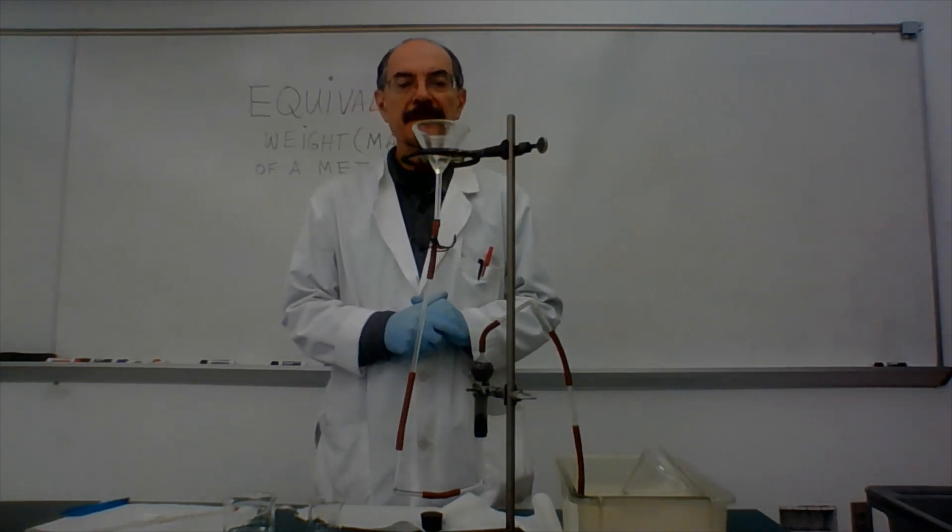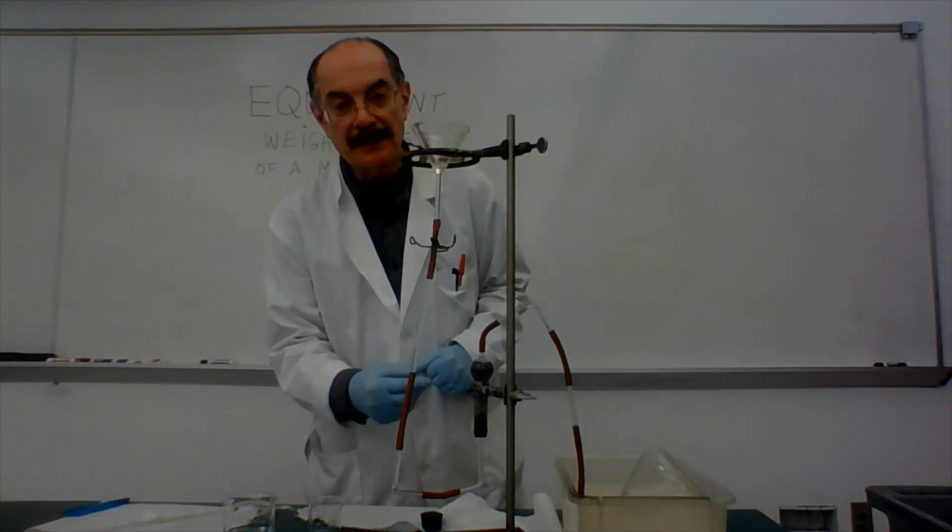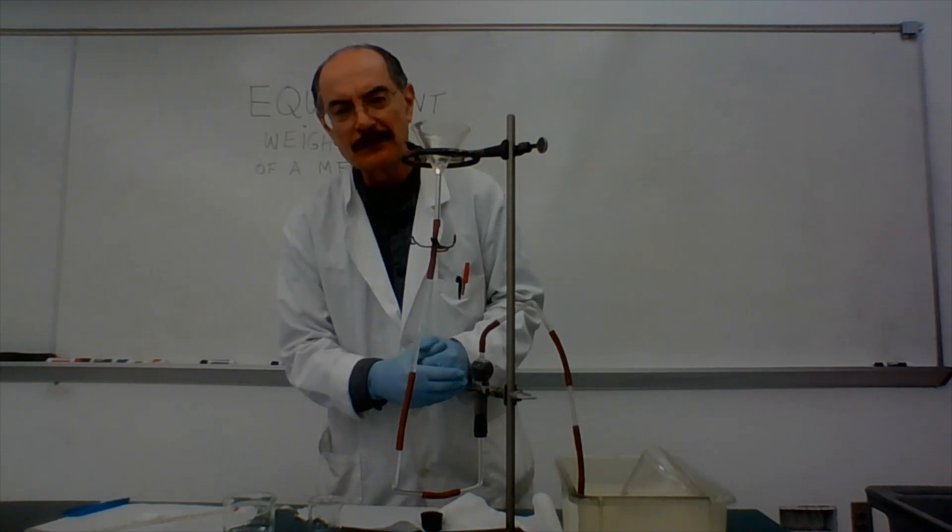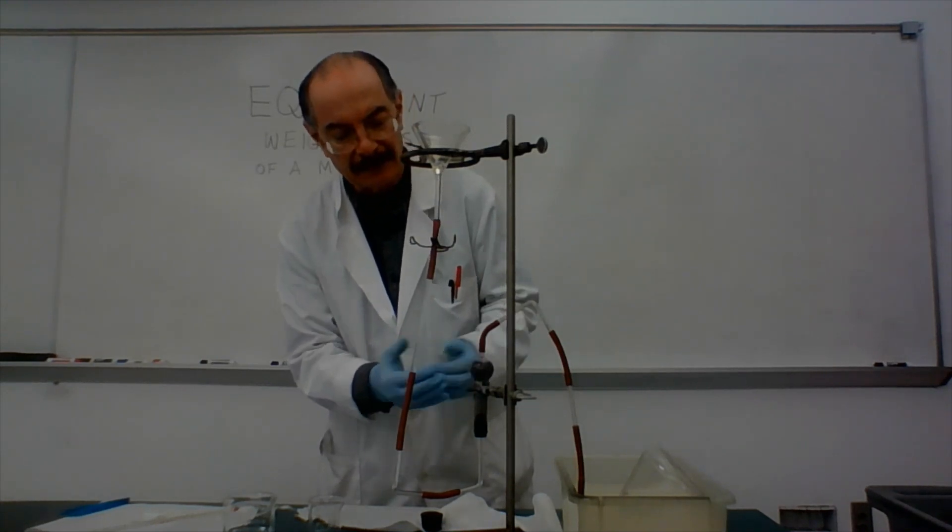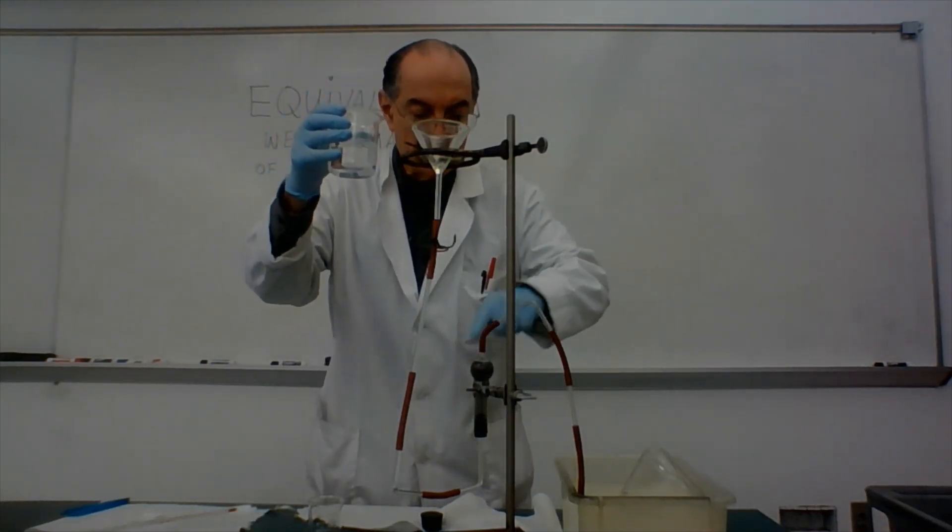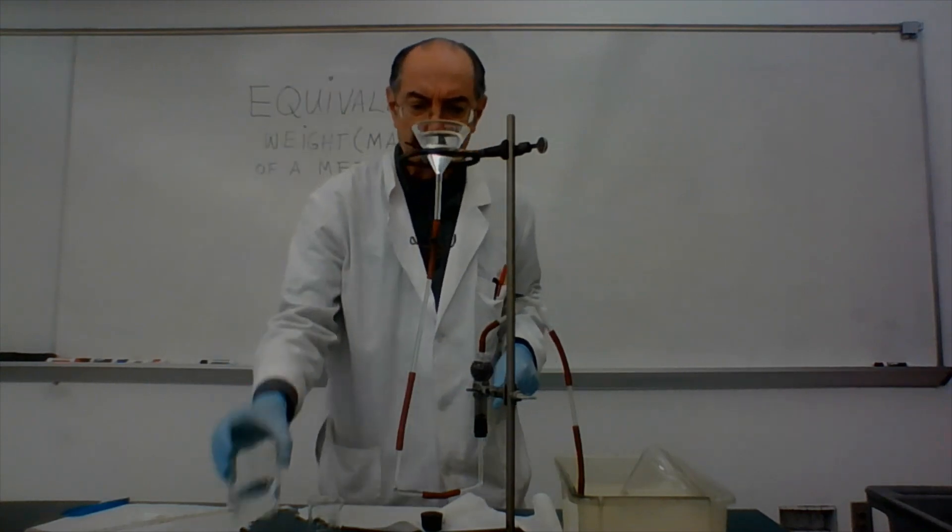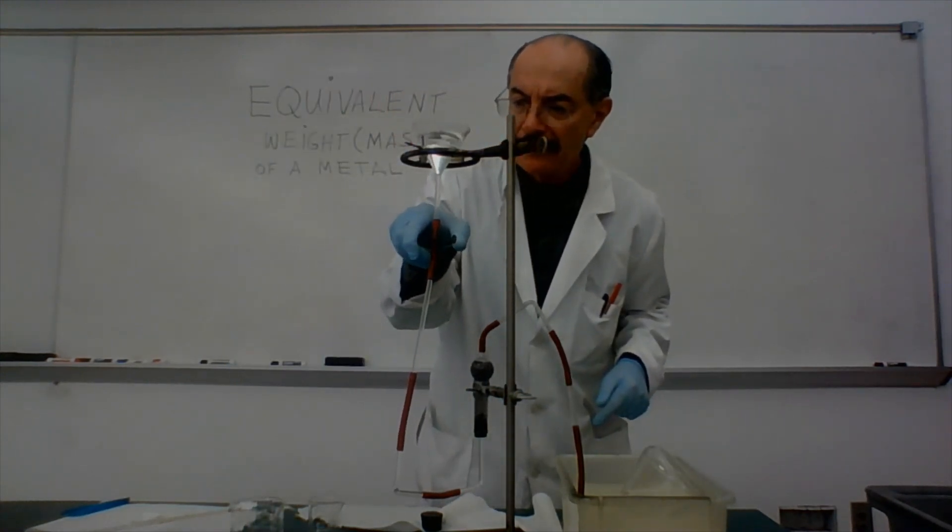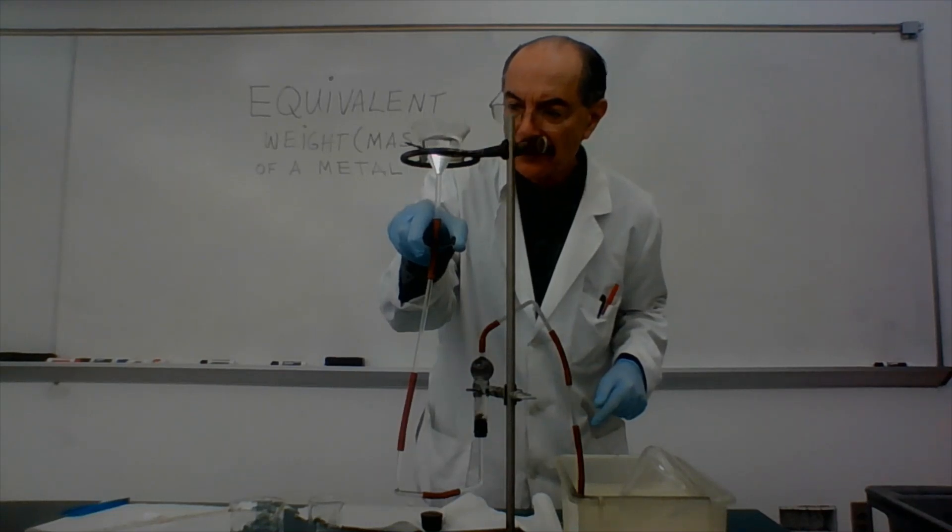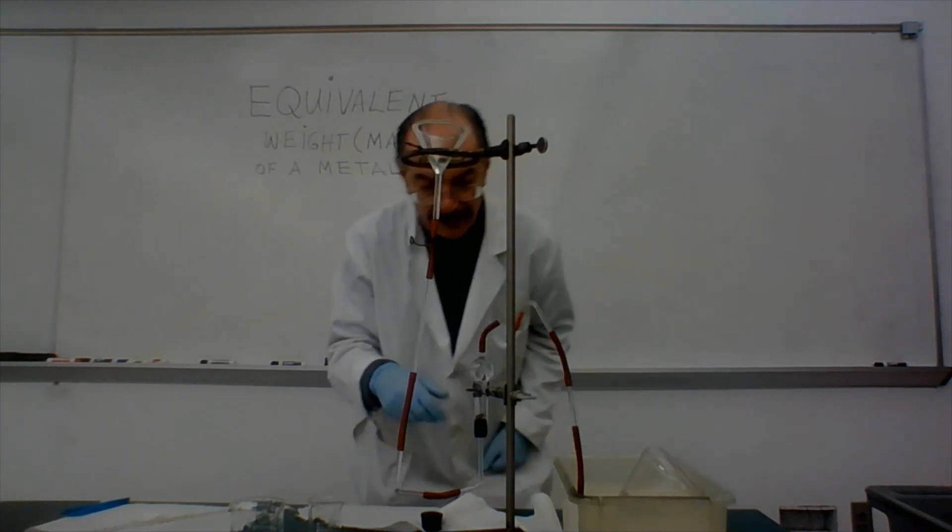Okay, we are back. And at this point you see very little bubbling happening. One of the things that may happen is that the liquid here above where the metal was has gotten very dark. That's because our copper mesh was probably dirty, had other oxides and stuff in there that got kind of removed. So what I want to do now is I want to take some water and give this one final chase to get rid of all the hydrogen product in there. So I'm going to fill up the funnel here with water and I'm going to chase down everything that's in there, all the reaction mix, make sure all the hydrogen is collected. There's no more stuff in there. So I'm going to give it a good chase here. And now there's no more bubbling. I've gotten rid of it.